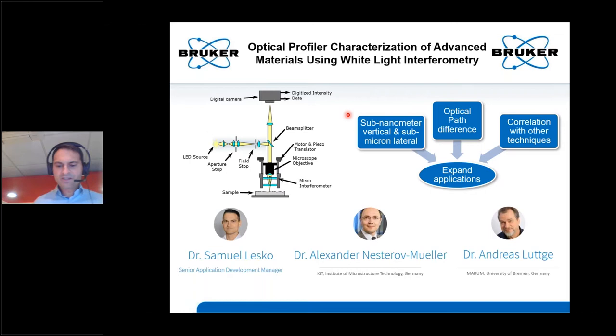So today we'll start with some kind of overview through myself, and then I will hand over the presentation to Alexander, who will use the white light interferometry profilers to measure potential interactions between antigen and antibodies. We will finish with a third talk from Andreas that will talk about everything dealing with corrosions and correlating optical profilers topography together with micro-Raman mapping and spectroscopies.